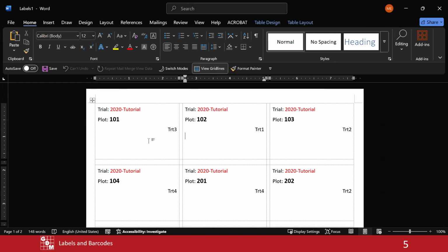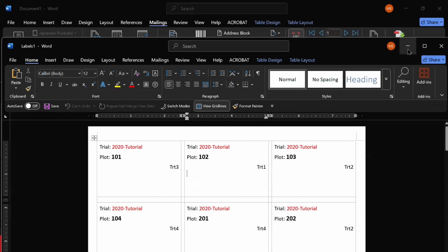And now I can connect my printer, make sure it's all good. It's this nice, very simple separation of that previous process of setting up the label. Here is my label. Nothing else hidden, just the content that I wanted. And the other reason I like this is because it was a separate file, a separate window that I'll just minimize right now.